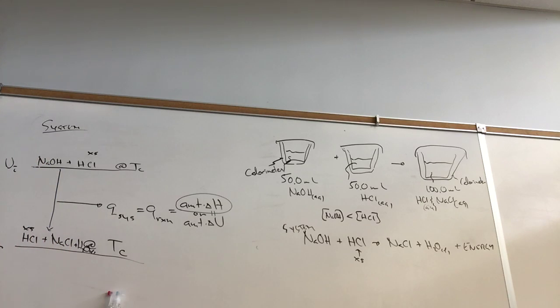That's different than KClO3. Yesterday you did KClO3, and as the O2 was being produced, what happened? As the O2 was being produced, it forced the water out of the Florence flask into the beaker, right? And so the pressures could be equalized.